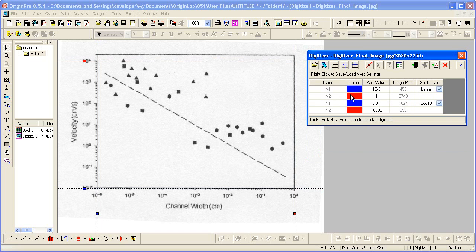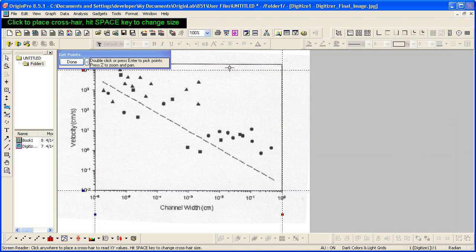And now we can begin to pick new points. So I click on that. The get points dialog comes up.